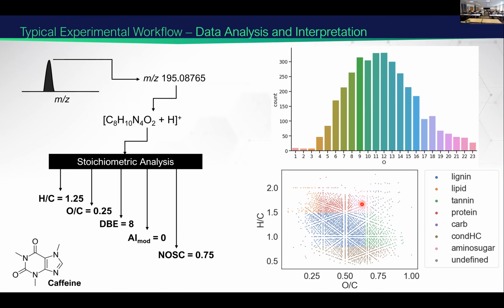You can go beyond that, of course. You can do really sophisticated statistical analysis and interpretation, especially when you've got larger sample sets. This is really where the strength of MONet is going to shine as the data sets grow and evolve.